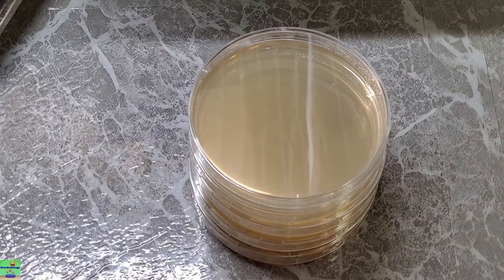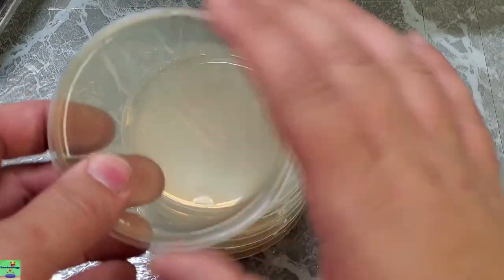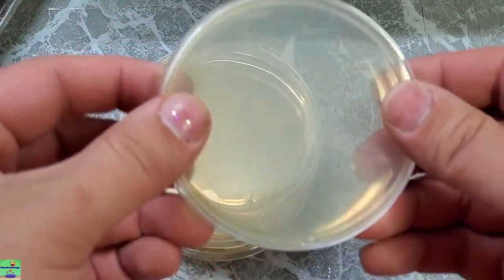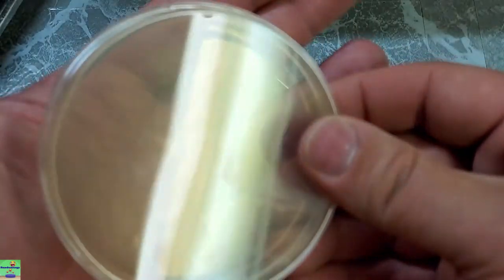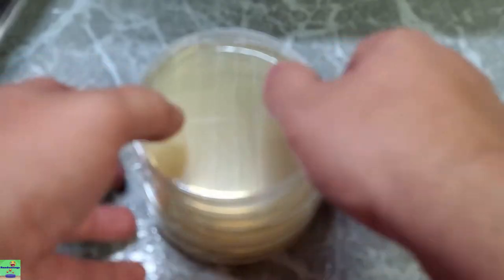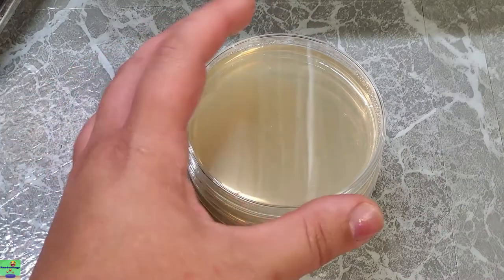I usually just do the common names, and because I know what it is, I'm not submitting this for anything scientific. This is just for my own curiosity and hobbies. I don't know if you can see, but there is an X there on the agar, and hopefully with any luck we'll have some mycelium start to sprout from those spores that we deposited onto the surface of these. Now we're probably going to deal with contaminations. I'll show you how to do that in another video.